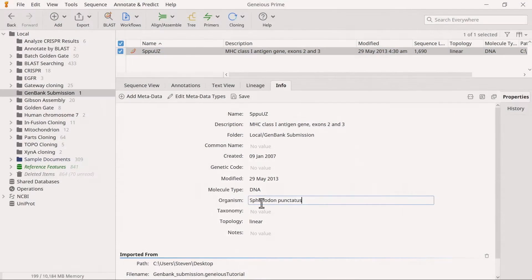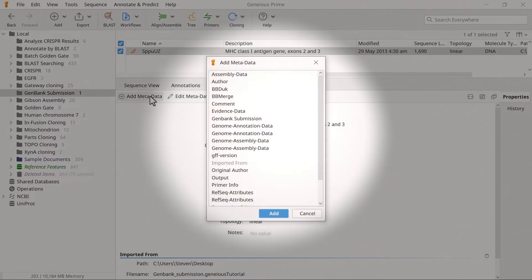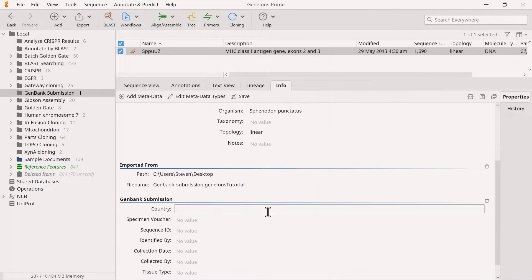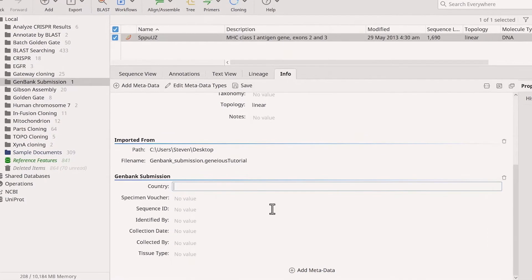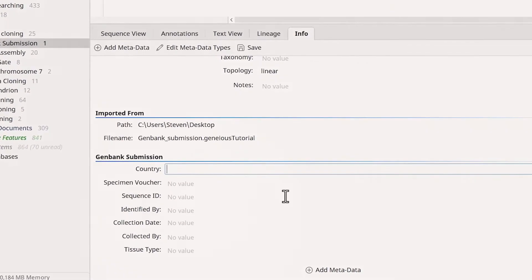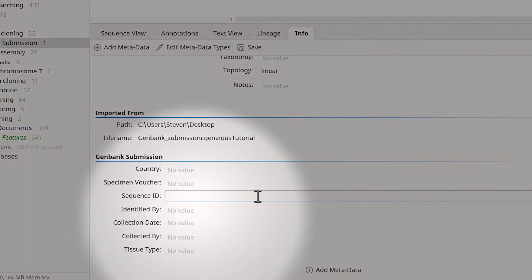For additional fields, click Add Metadata and choose GenBank Submission. The default GenBank Submission fields allow you to add extra information about the specimen from which the sequence was derived, such as country, sequence ID, and collection date.